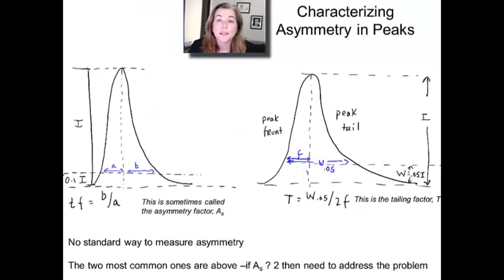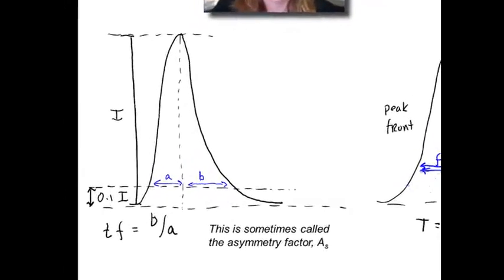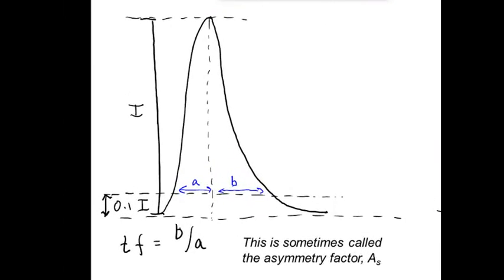So what you want to do is kind of characterize the asymmetry of a peak. And there's two different ways that I've seen people do it in different textbooks. This is not a standardized thing, but these are at least common ways of doing it.